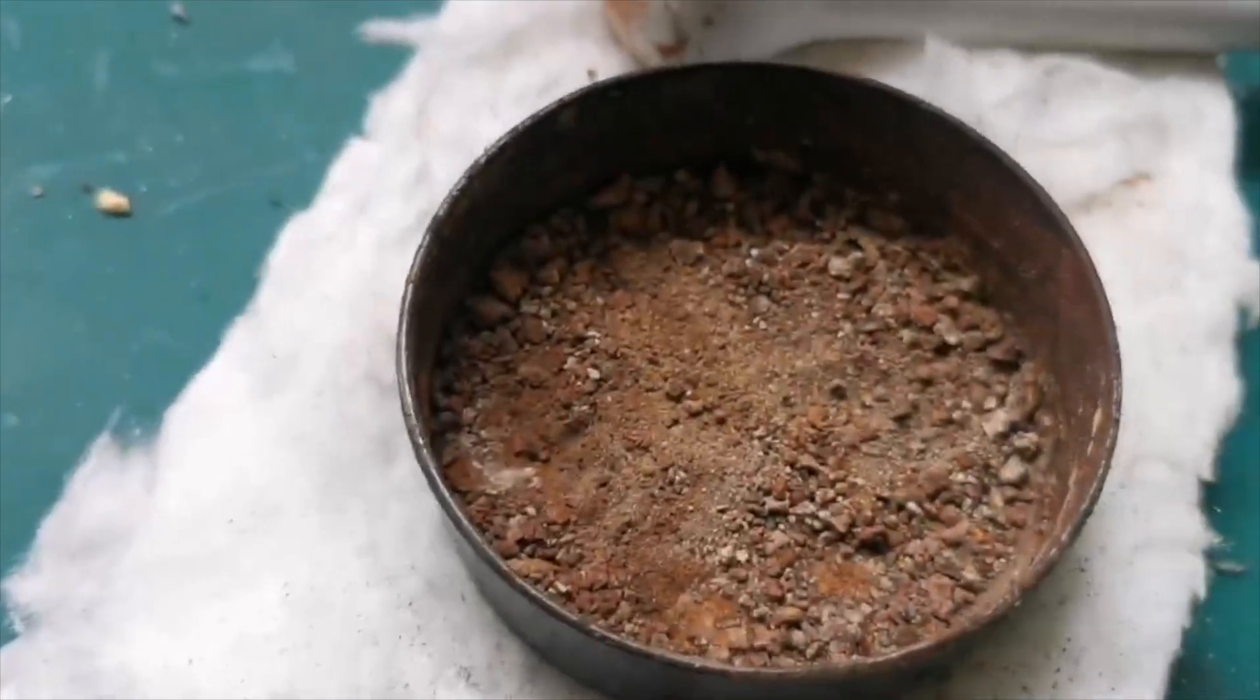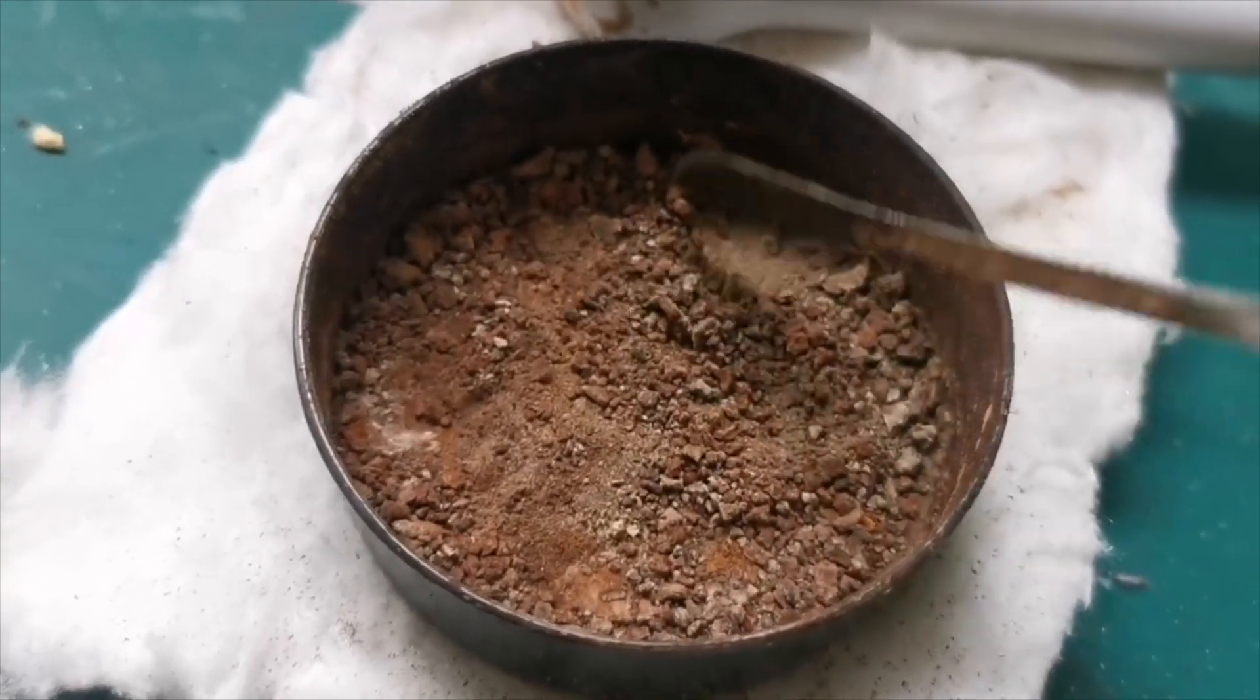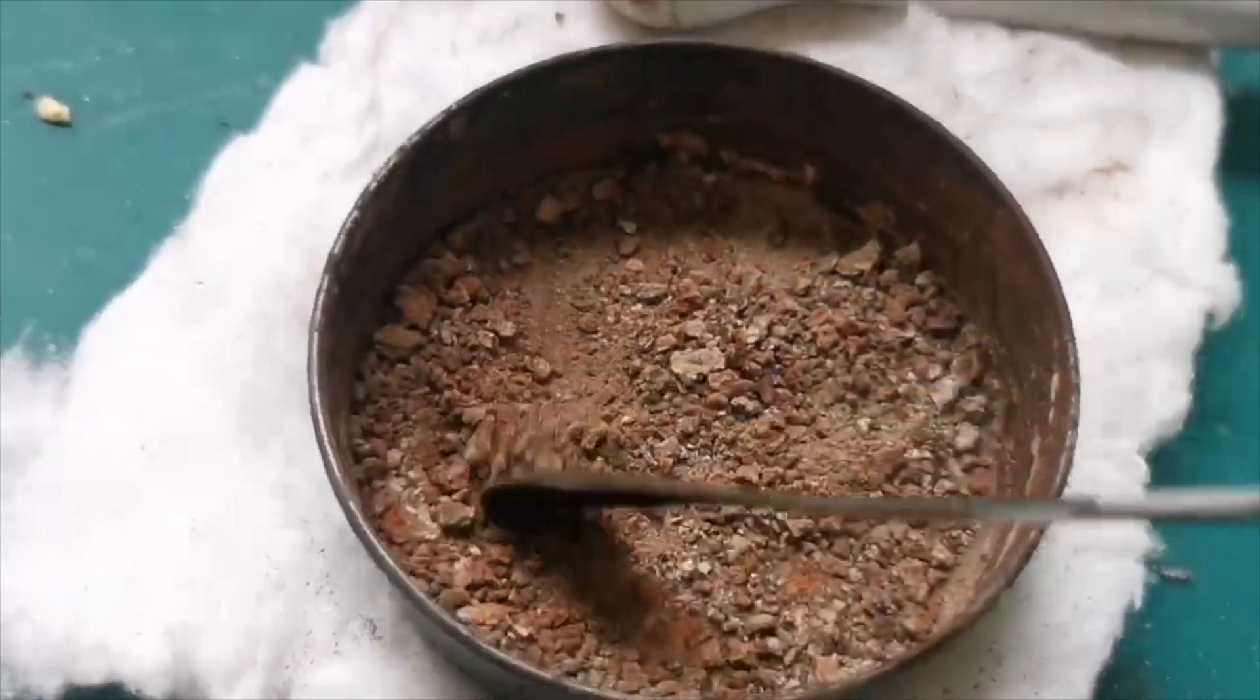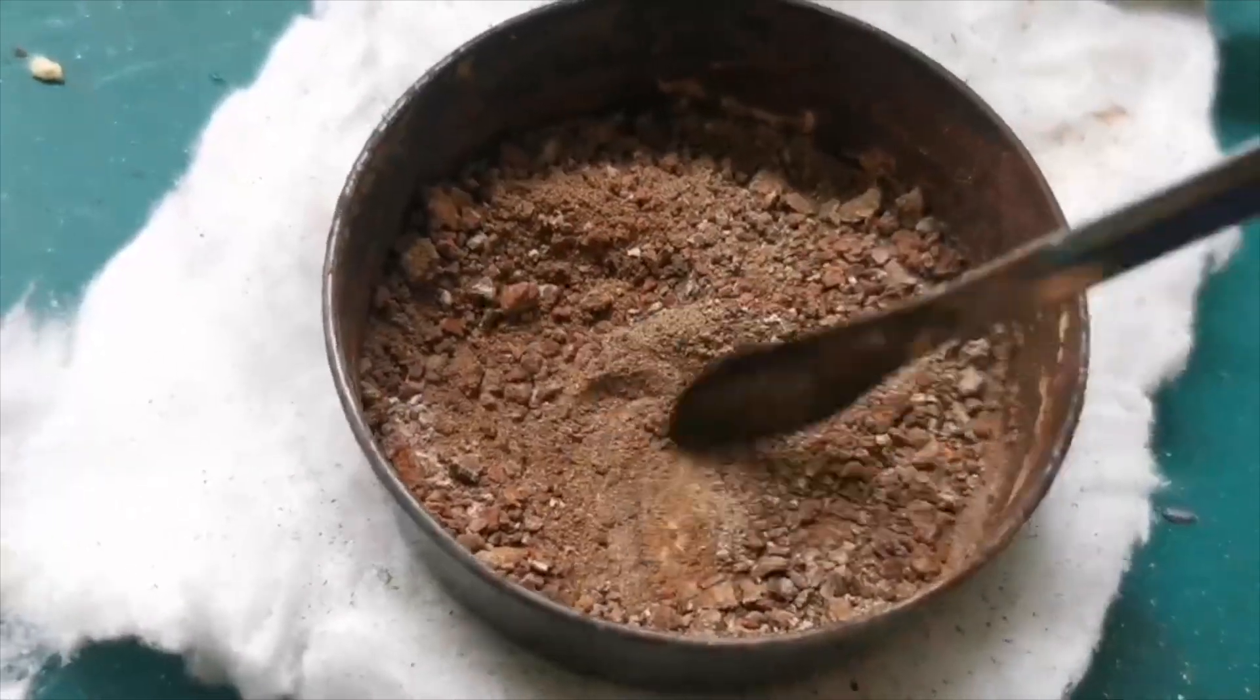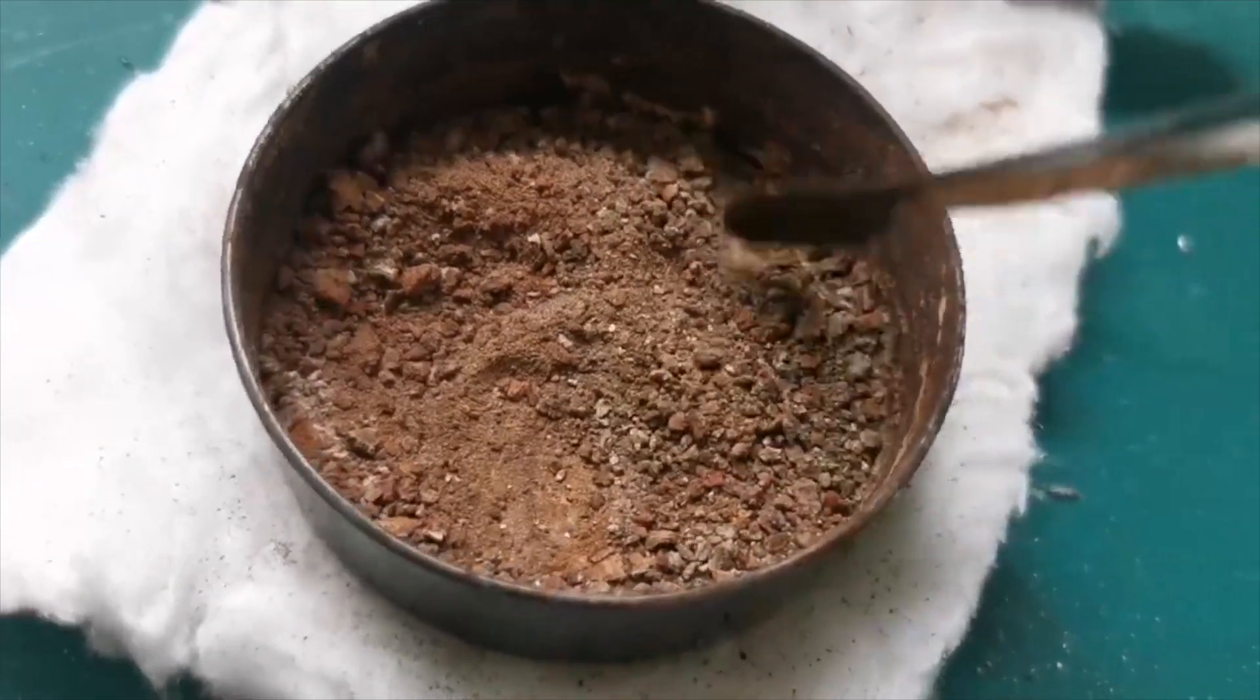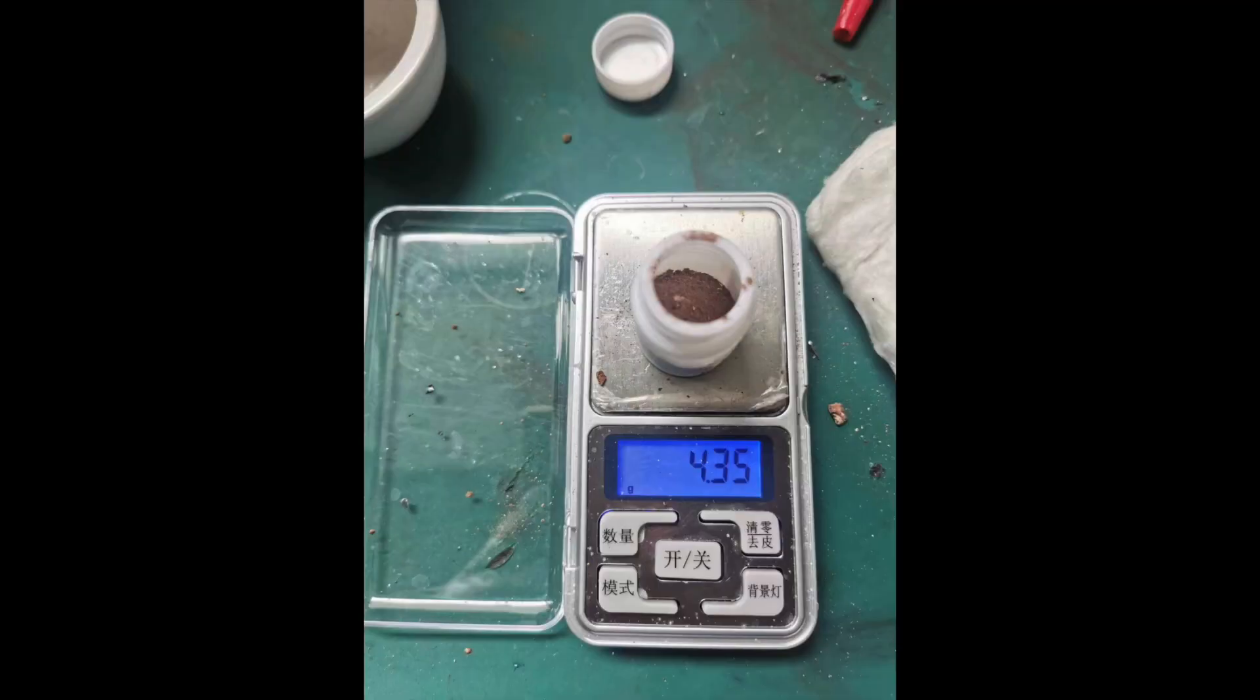Finally, I took out my dish of lanthanide oxalate and roasted it with a blowtorch to convert it into the oxides. Notice that it is not uniform in all places. Underneath the top layer, there were still a bunch of unreacted oxalates, so the color was a lot lighter. I transferred the brown powder into a vial, and its mass is 4.35 grams. I can use this to make anhydrous lanthanide chloride as well, and then electrolyze it to make the metals.